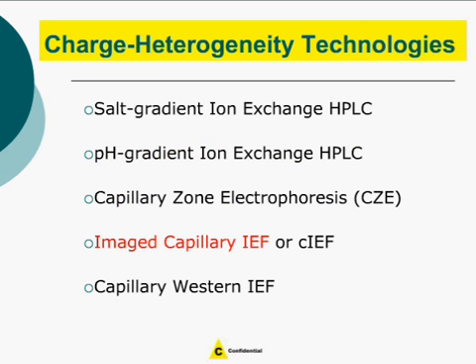There are various analytical techniques available to characterize charge heterogeneity, and I've highlighted some of the most commonly used ones in this slide. Each of these methods has its own advantages and disadvantages.